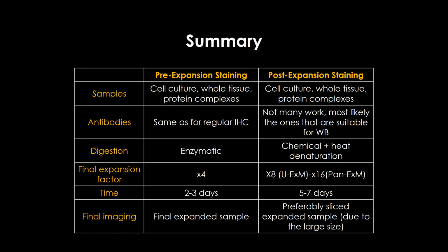And the final imaging: as much as you expand the sample, it becomes thicker and larger, so it's more difficult to visualize it. So in 4x, it wasn't a problem, but when I did the 16x, I had to slice the sample in the middle to make thinner sections to visualize it. So it's also something to take into account, and also the sample becomes really, really large, so it will take longer to visualize it.